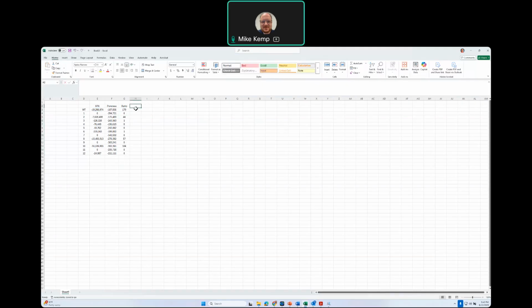So what we want to do also is to normalize. How you normalize depends on the particular experiment you're doing. Oftentimes we'll make whatever has the highest ratio of protein to Ponceau an arbitrary value of 100. In this case, I'm going to say the wild type is our 100, and that's our normal protein expression. Everything else we're going to compare to that. So we're going to make a formula where we divide the sample ratio by the wild type ratio, G3 divided by G3, typically multiplied by 100 to get a round number. We want to normalize everything to that.